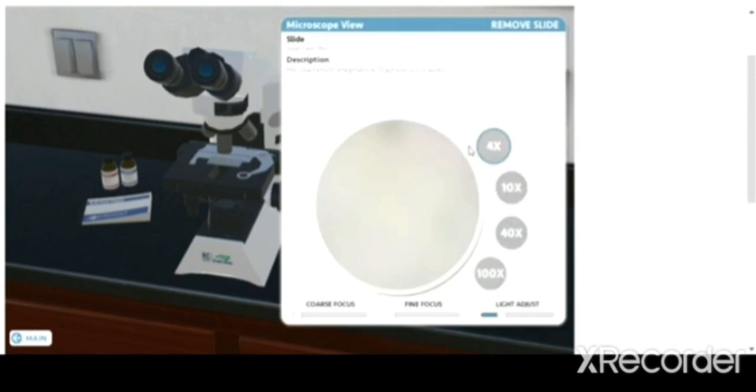Acid-fast stain is able to differentiate between two types of gram-positive cells, those that have waxy mycolic acids in their cell walls and those that do not. There are two different methods for acid-fast staining. They are the Ziehl-Neelsen technique and the Kinyoun technique. Both of these techniques use carbol fuchsin as the primary stain. The waxy acid-fast cells retain the carbol fuchsin even after decolorizing agents, like an acid-alcohol solution, is applied.